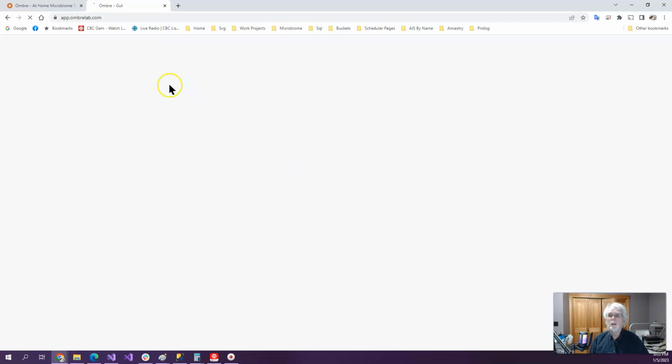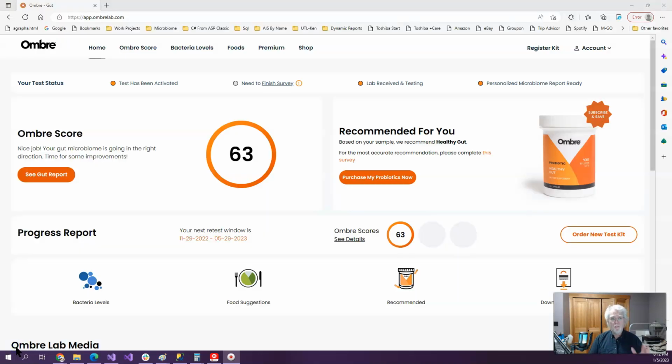And we are still spinning, as you can see in the top left corner. I'm going to pause this and we'll resume when the screen changes. And as you see, we just got to the point of loading. Give it a few more seconds and let's see if it actually does load. And I have eventually successfully logged in. So now that I'm logged in, let's take a look at some of the things.